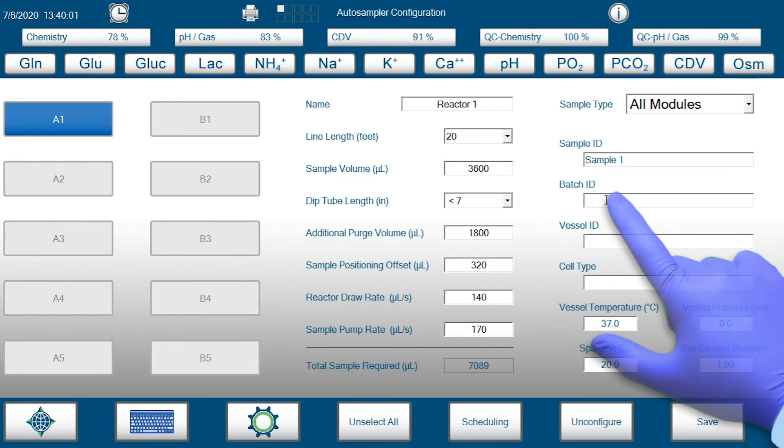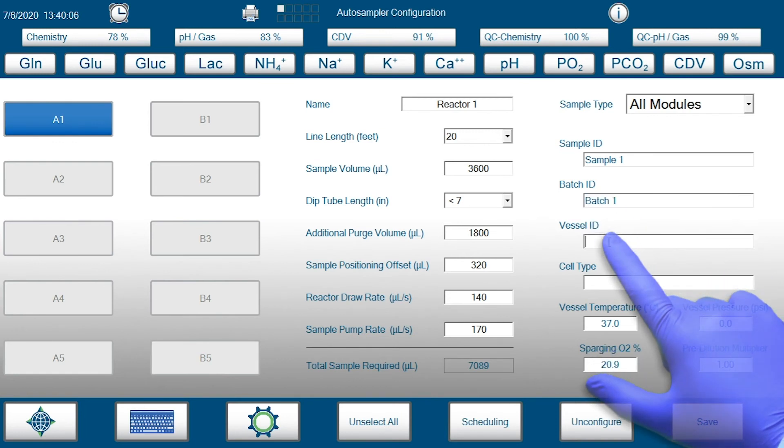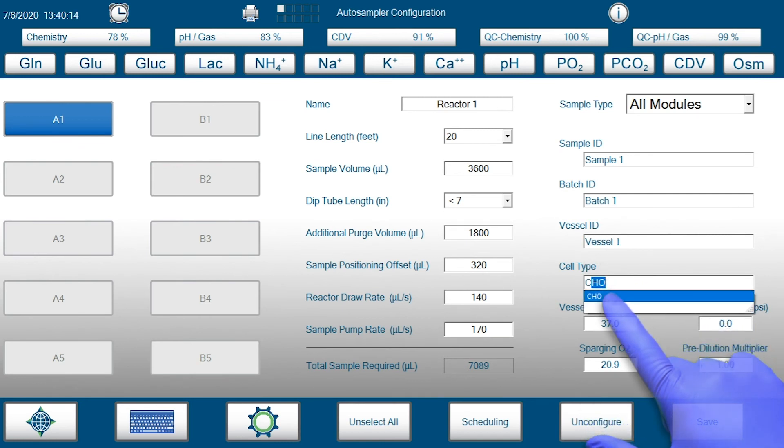Once connected, OLS software provides detailed information regarding bioreactor sampling, OLS system status, bioreactor data, and pending events.